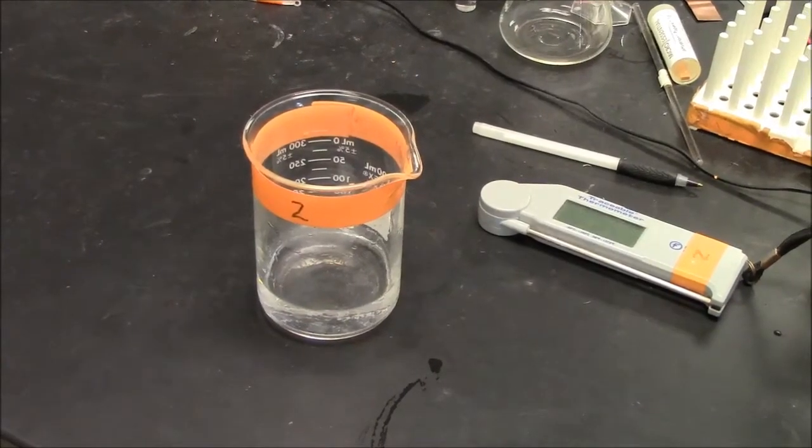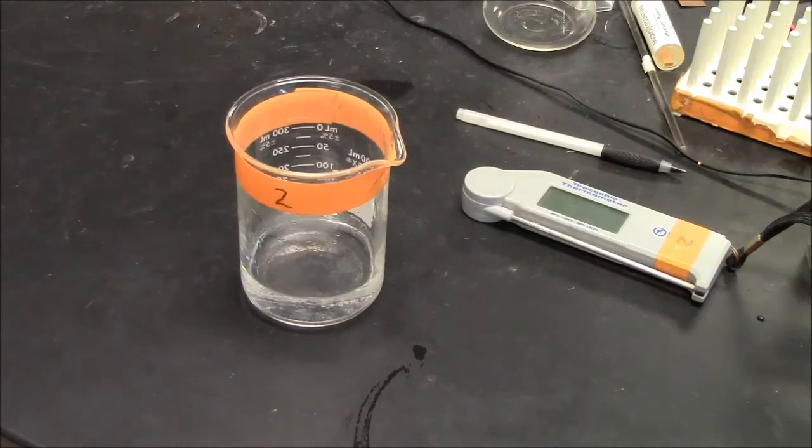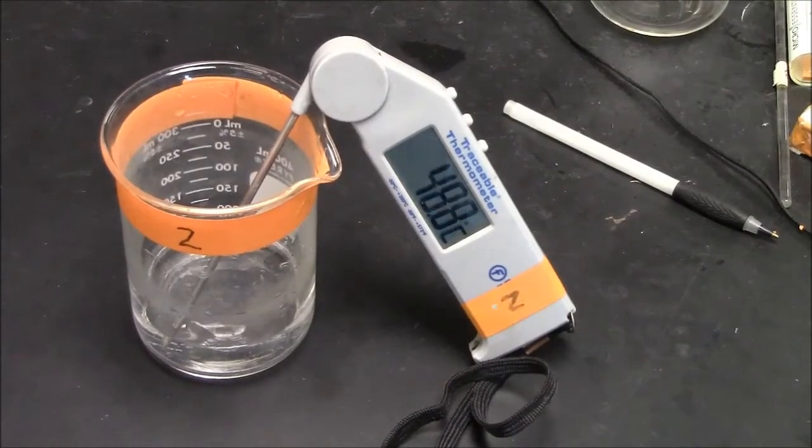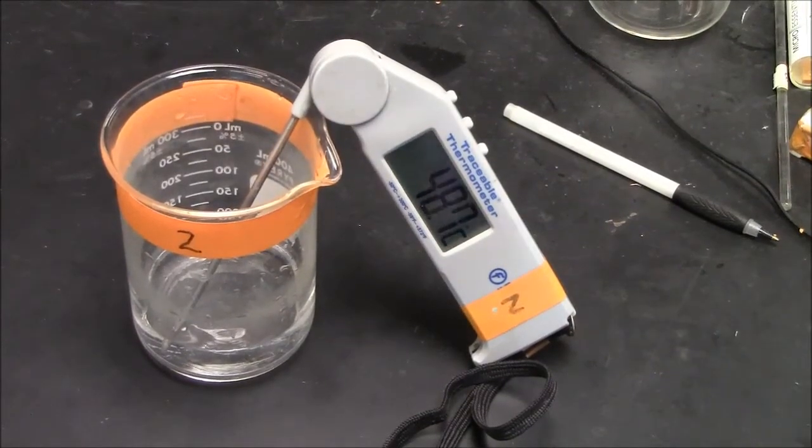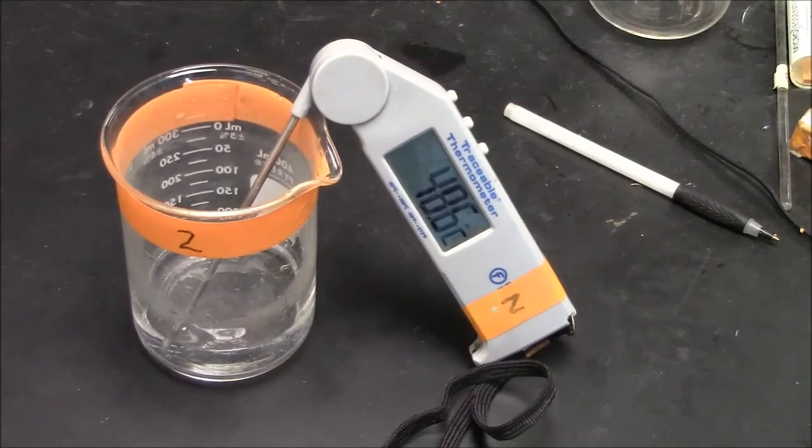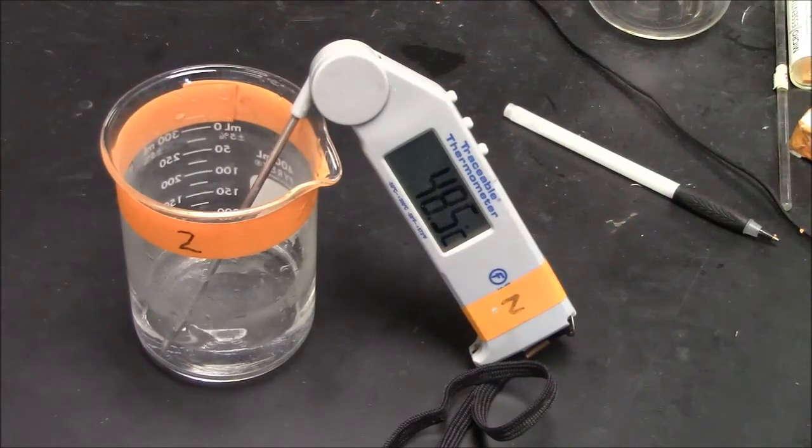To test that, we can use a warm water bath which will exceed the phase transition temperature, and then we may see evidence of polymerization. Here I have a water bath about 48 degrees, and I will immerse the polymer, or the suspected polymer, in this warm water bath to see what I get.